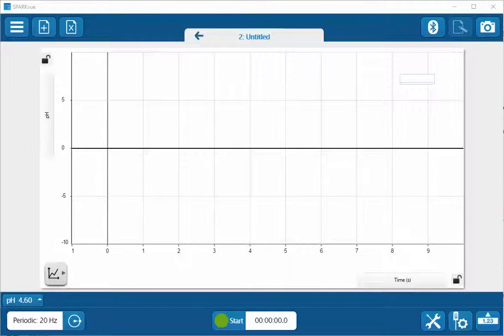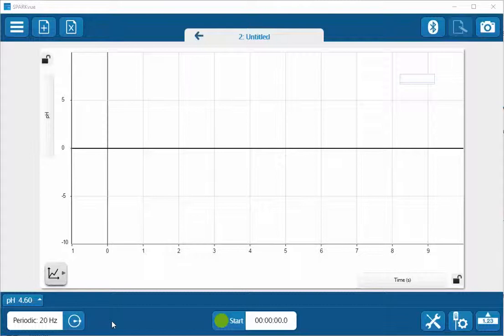This is a video showing how to calibrate a pH sensor within SparkView 4.0 and beyond. I've previously paired a pH sensor to my occurrence of SparkView.